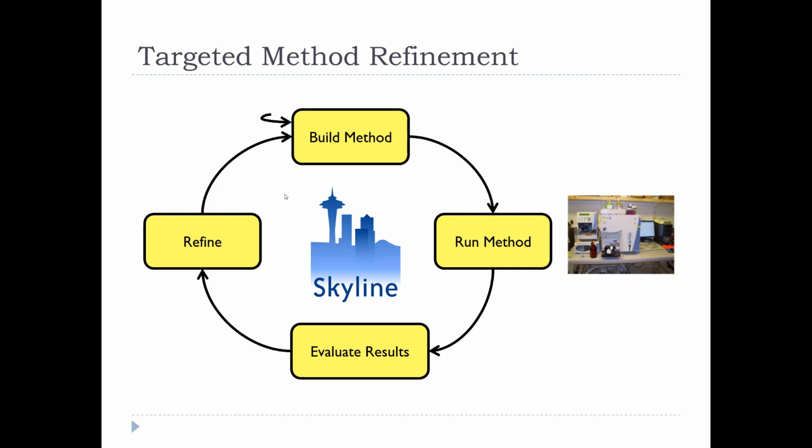So before you start looking at data that you're intending to be your quantitative assay, you go around the cycle potentially multiple times, improving your assay so that you get a really highly precise assay with a low amount of interference, no peptides with degradation.